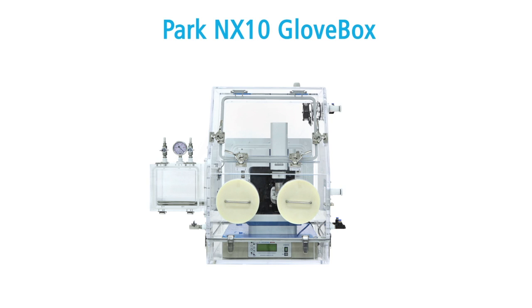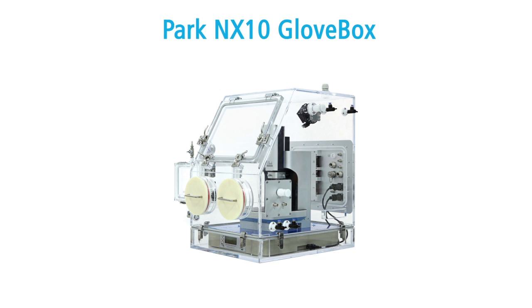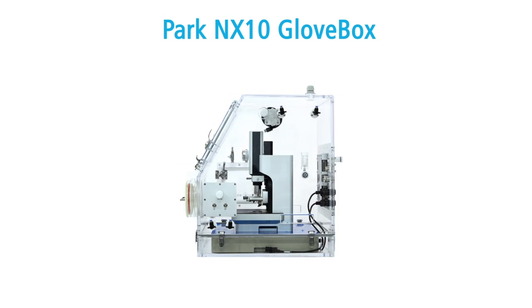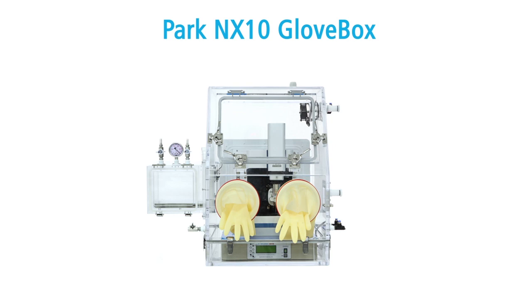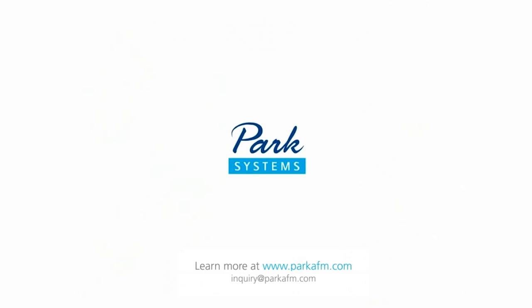Glovebox for PARC-NX10 gives you the power to regulate environmental conditions during sensitive sample measurement with your AFM, increasing your productivity, and enabling you to perform groundbreaking research. For more information, please visit our website at parkafm.com.